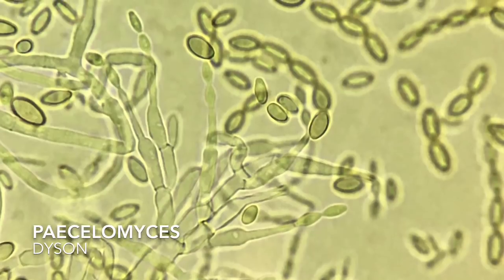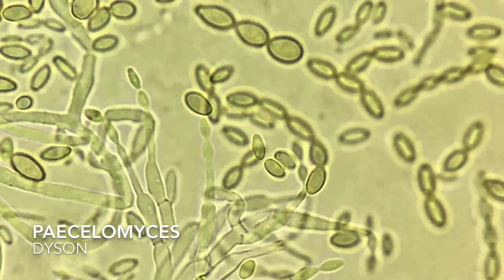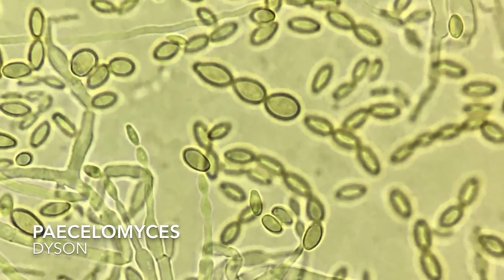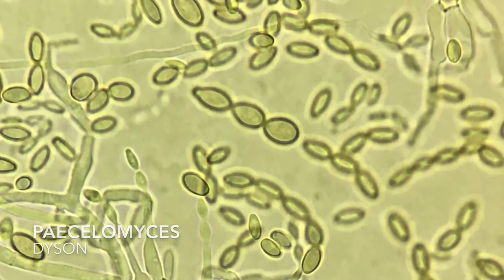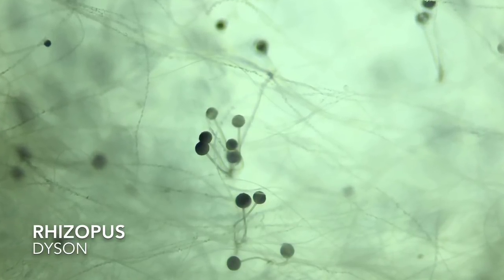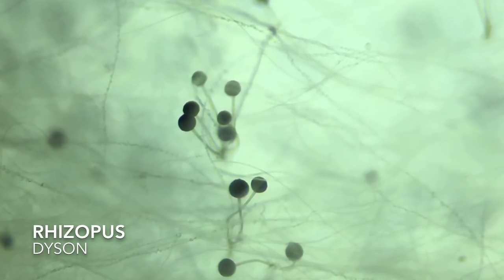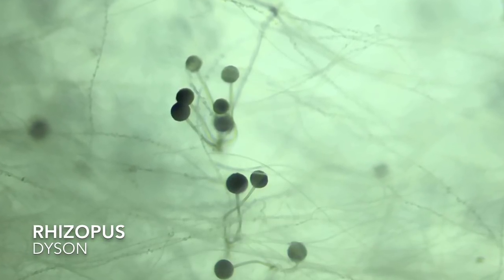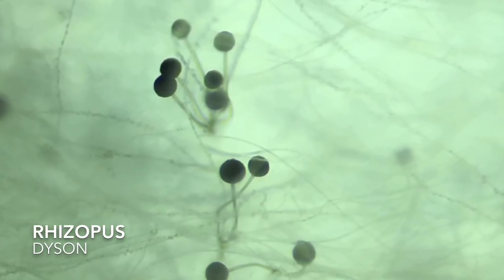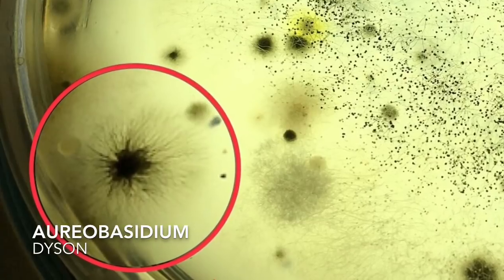The next three genera were found specifically with the Dyson sample. The first is Paecilomyces, which is very similar to Penicillium but has a different growth form — you can see differences in the spore structure, which are more lemon-shaped. It's a decomposer of vegetation. Then we have Rhizopus, which I mentioned earlier. Many of the Zygomycetes lack the broad spectrum of enzymes that the other fungi have, so they tend to act on simpler nutrients, but they grow incredibly rapidly — so fast that they don't even form septations in their hyphae.